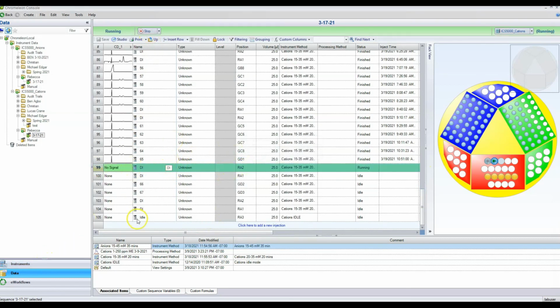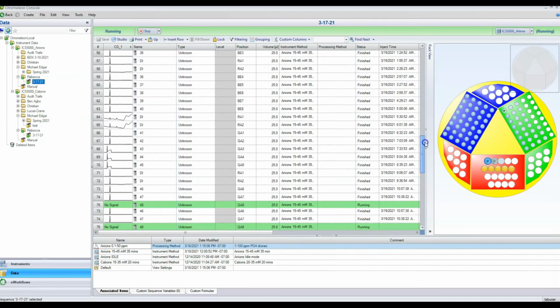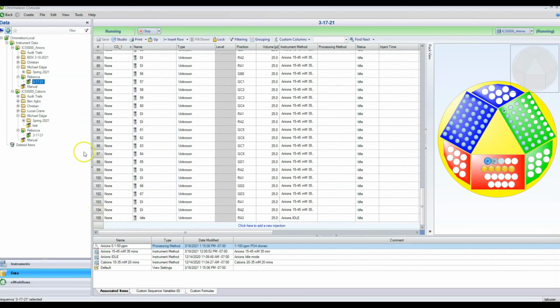And now we wait. A cation run is faster than an anion run. It takes about 20 minutes per sample, whereas the anion run takes about 30 minutes per sample. So if you have a run that's 105 samples long, you better plan for about 3 days of this instrument running. And definitely be sure to come back once a day to refill those bottles.